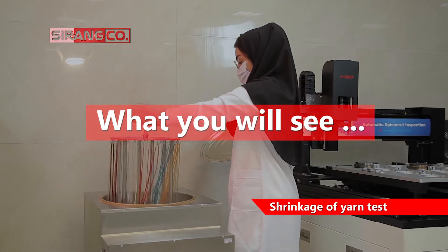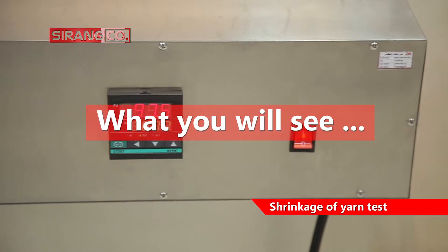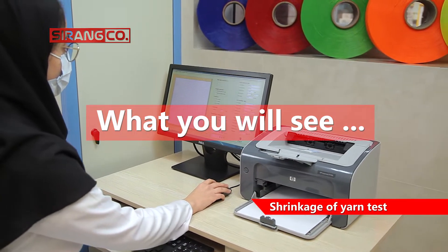Shrinkage of yarn is a decrease in yarn length due to heating processes. Yarn length before and after the process is measured under certain stress and is expressed as a percentage of the initial yarn length.